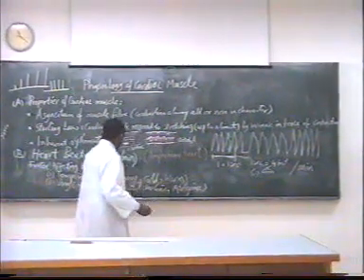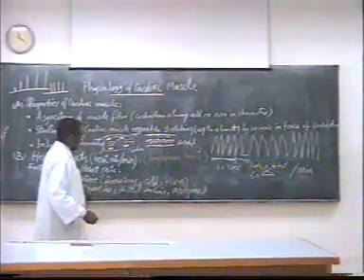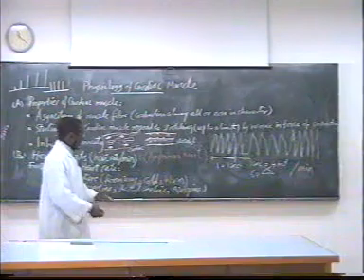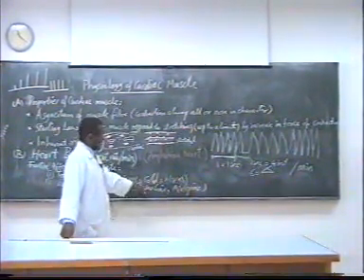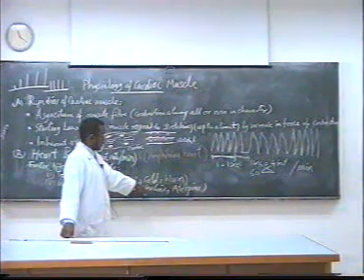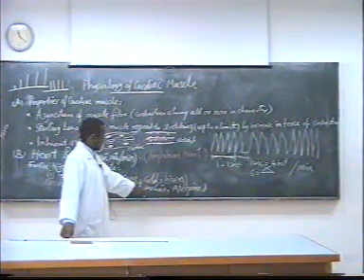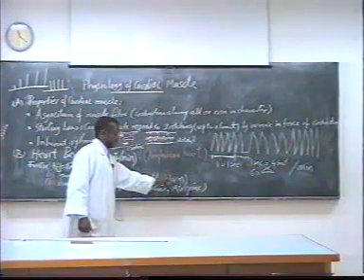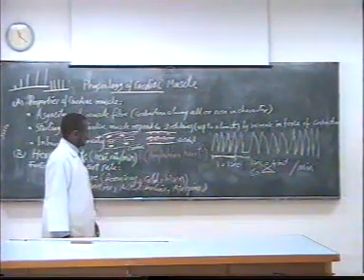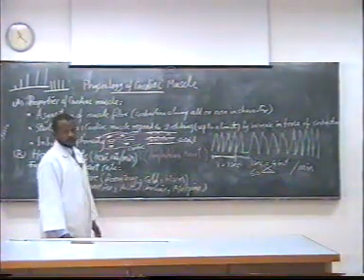heart rate. Usually, adrenaline increases the heart rate, and acetylcholine decreases the heart rate. If we add atropine, it will reverse the effect because it's an antidote for acetylcholine. So the heart will resume beating again after addition of atropine.